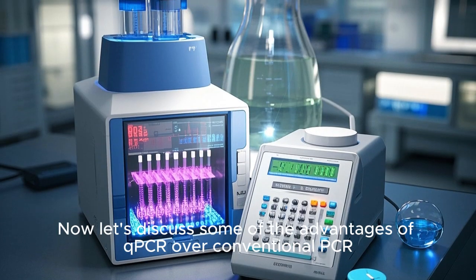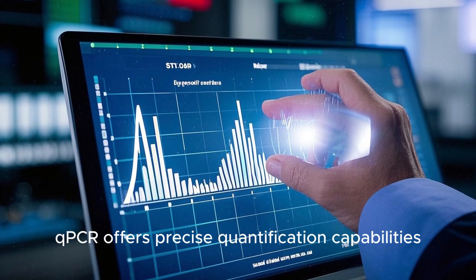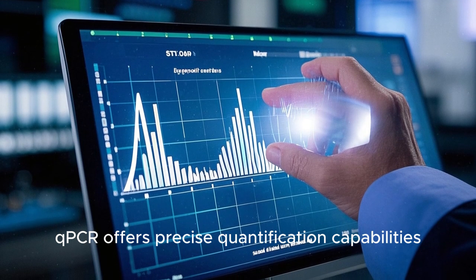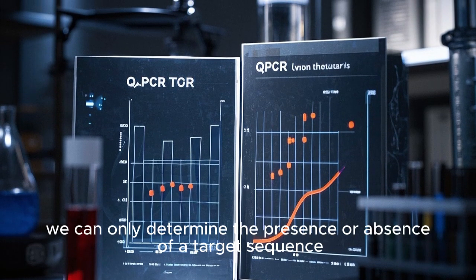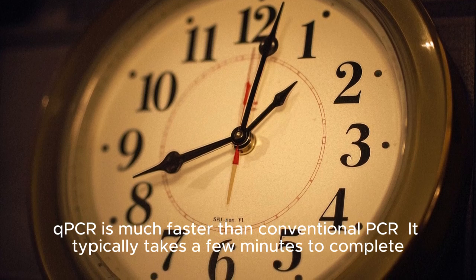Now let's discuss some of the advantages of qPCR over conventional PCR. First, as we've mentioned, qPCR offers precise quantification capabilities. With conventional PCR, we can only determine the presence or absence of a target sequence. Second, qPCR is much faster than conventional PCR.